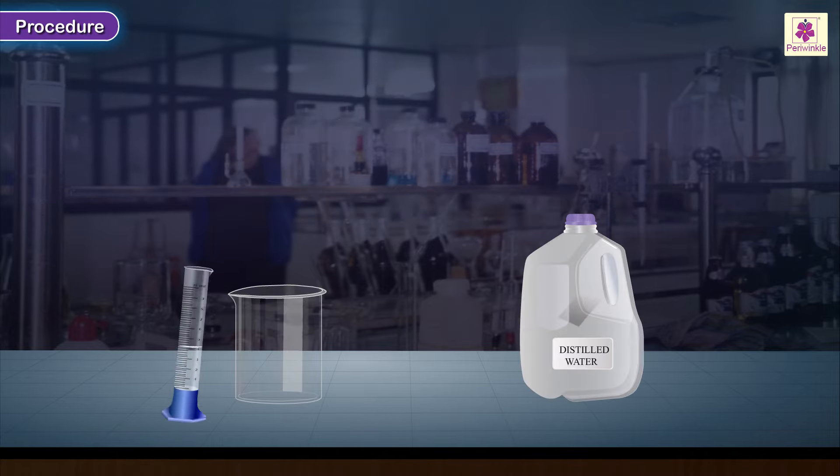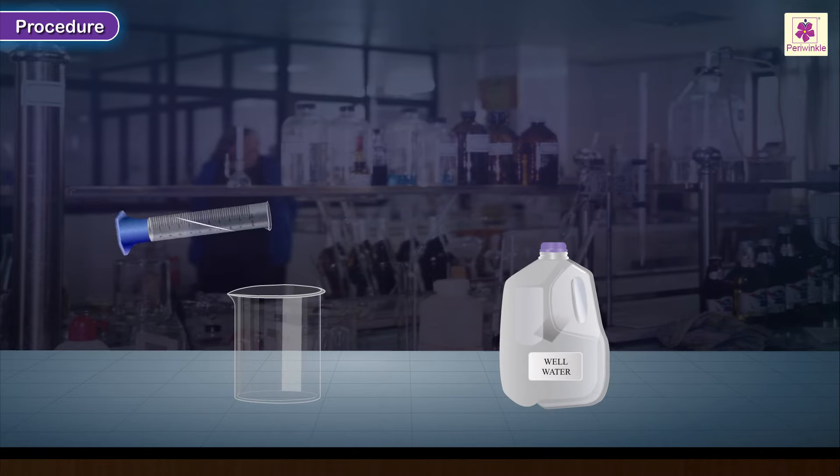Procedure: Take 20 ml of distilled water in a beaker and label it as A. Take 20 ml of well water in another beaker and label it as B.